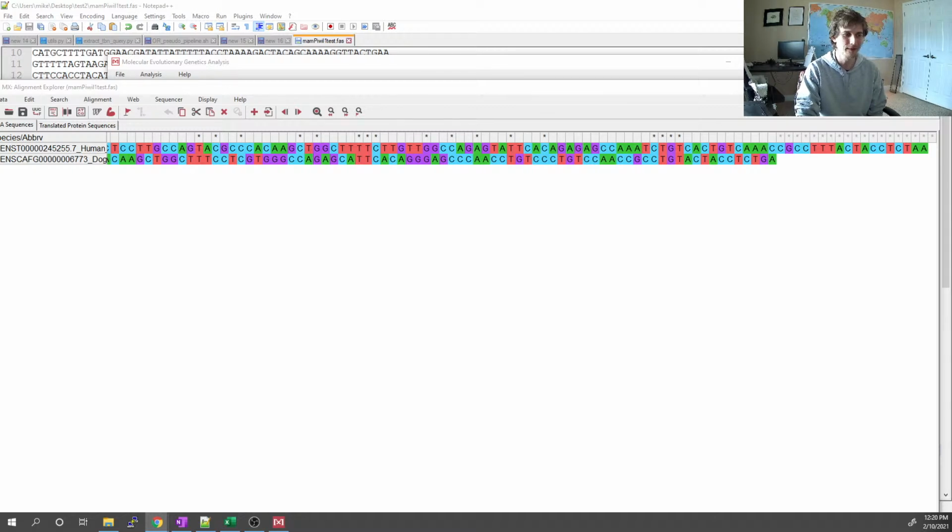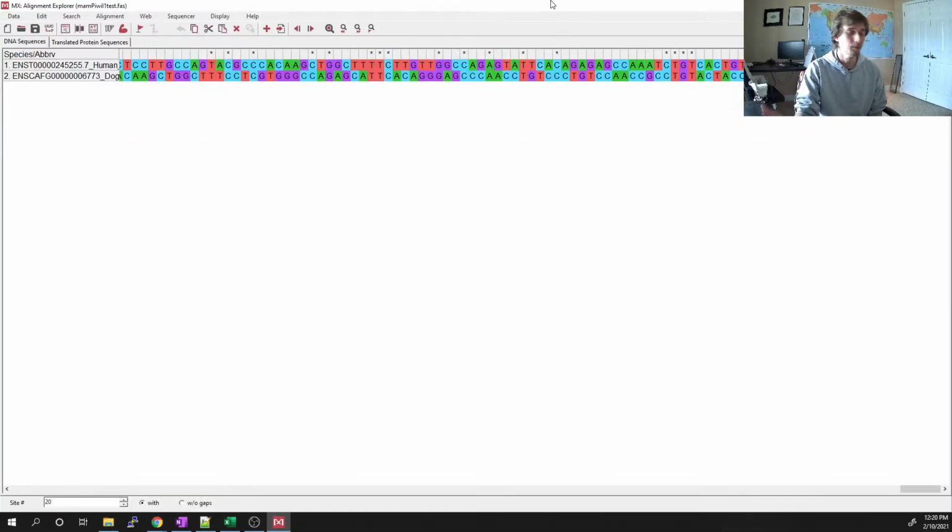So I don't want to use class time to poorly explain dynamic programming. But nonetheless, Mega has a built-in aligner. In evolutionary biology, in bioinformatics, there are at least a dozen different aligners. The first one was Clustal W, and that's still implemented in Mega.